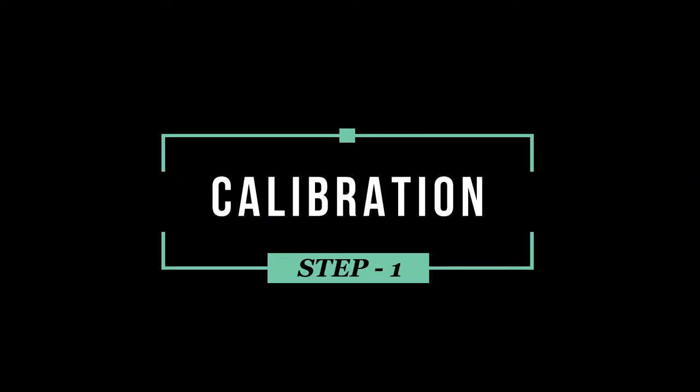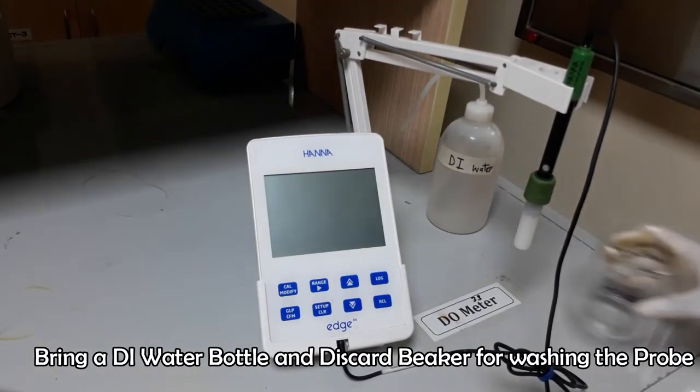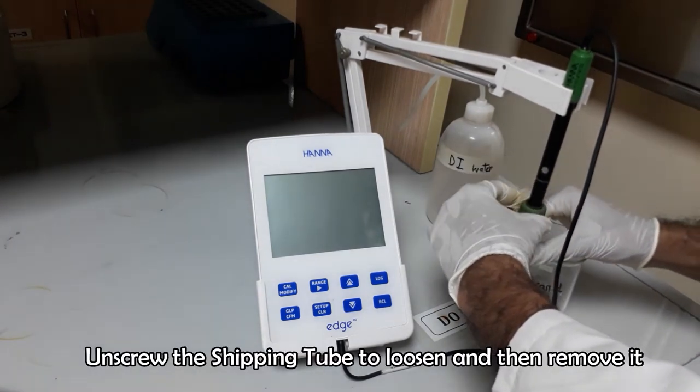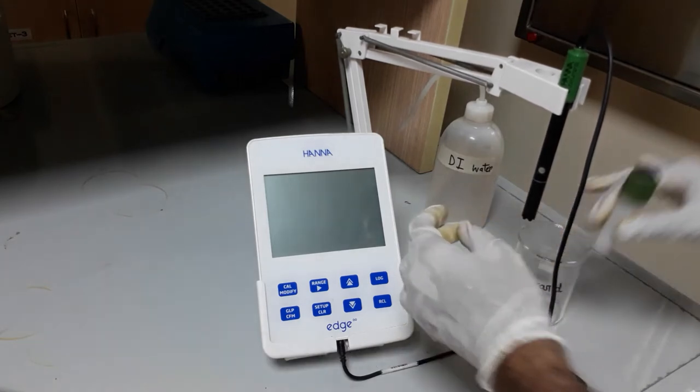First of all we have to calibrate the DO meter against 100% DO containing solution, which is DI water, and 0% dissolved oxygen solution. Bring a discard beaker and a DI water bottle for washing purpose. Remove the shipping tube from the probe.